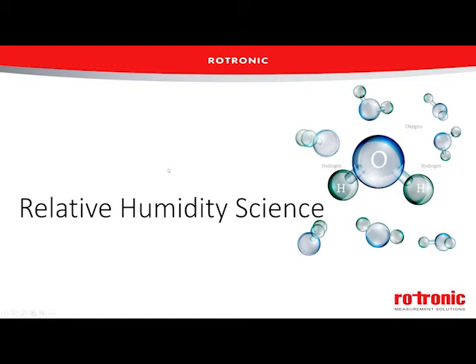Okay, let's go ahead and get into the presentation. And we'll start off with the science of relative humidity because, again, it's important to understand the parameter you wish to measure. And to do that, we need to understand the science. And this is not in-depth. If you want an in-depth discussion about humidity science, we did a couple of webinars that are in the on-demand section. One was relative humidity and dew point, the basics, and one was theories and definitions.